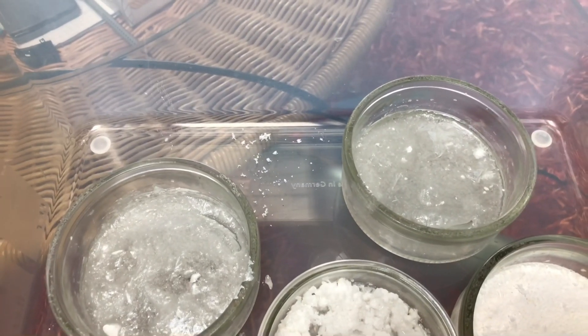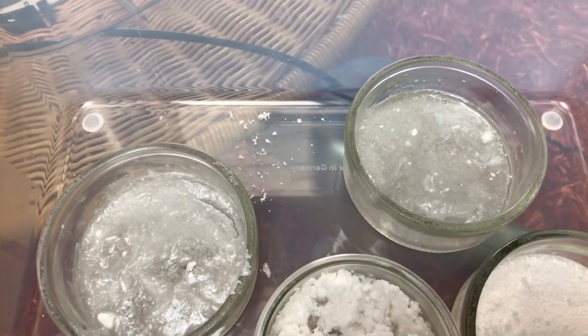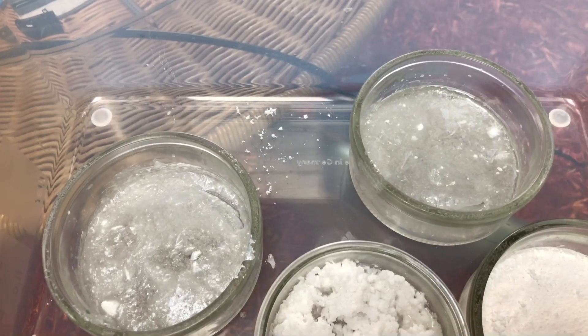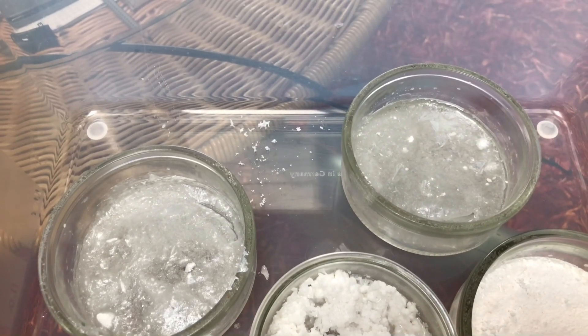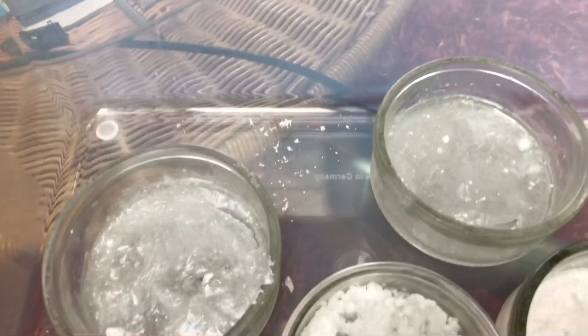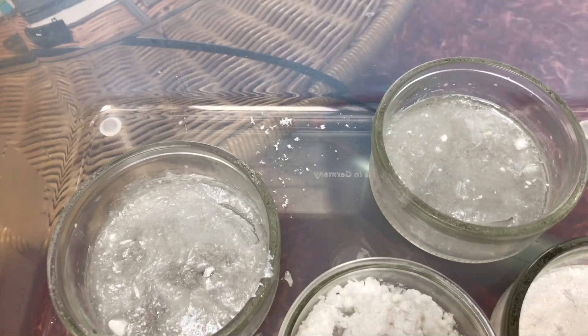While bubbling air through any solution of soluble lead, it is important that you have some sort of filter or hose leading outside, because some water-soluble lead salts will always become airborne. You don't want to contaminate your entire area and you don't want to inhale them. I use a syringe plugged with some cotton or a hose leading outside.